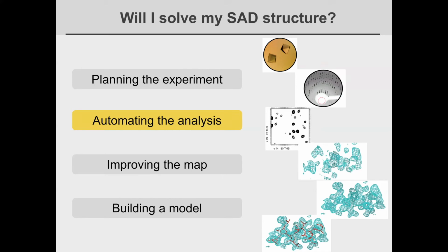What are the things which we should be looking at? Let's see. Somebody help me with what the question is asking. Can you hear me, Tom? Yes. Okay. Somebody was asking, what does data accuracy mean? They want to know a little bit more and what they need to look at.